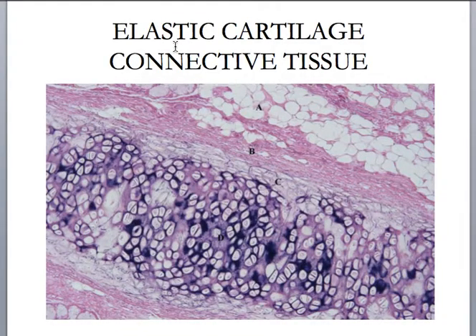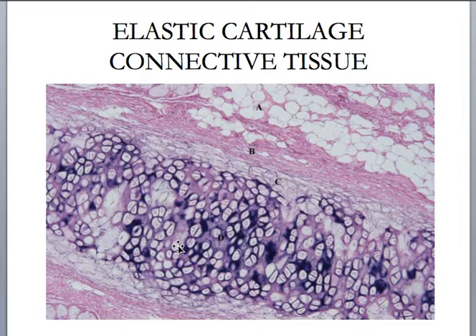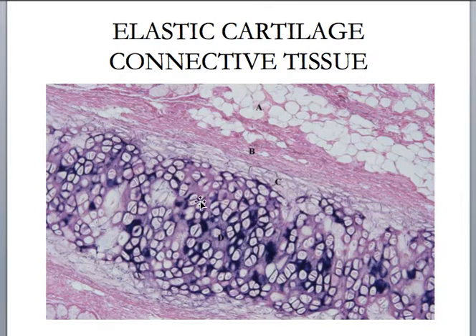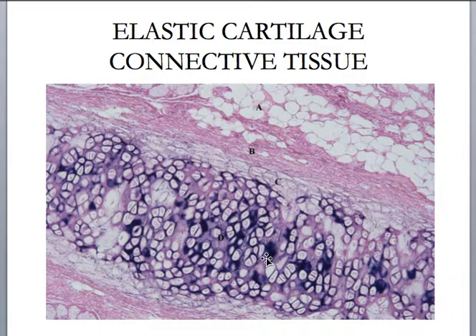This is elastic cartilage connective tissue. You might immediately think it looks like hyaline cartilage — well, it does. It's very similar, but also very different. If you look at the ground substance that surrounds all of those chondrocytes in their lacunae, you'll see all this dark staining stuff. So it's not nearly as glassy in appearance. It still has a little perichondrium and it still looks like little Smacks cereal, but the extracellular matrix ground substance has all this dark stuff in it and it's not nearly as glassy.